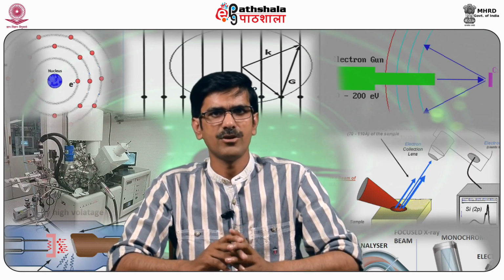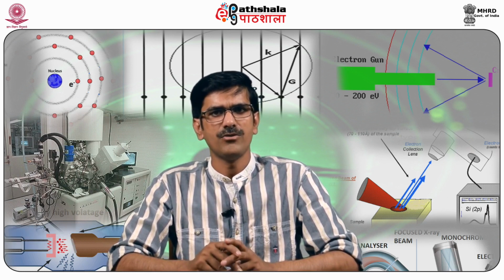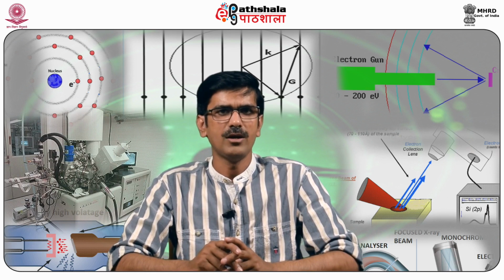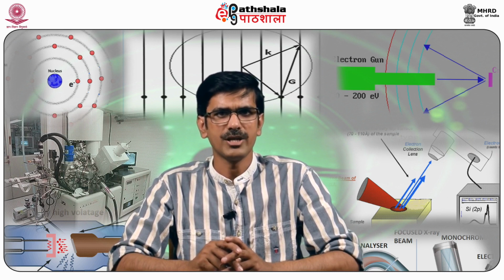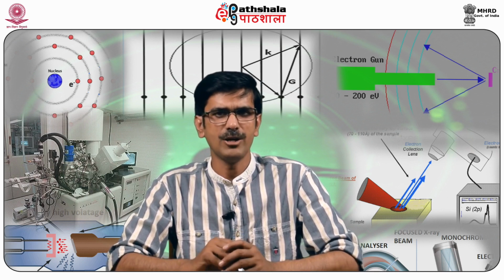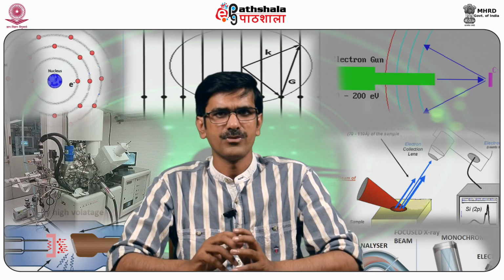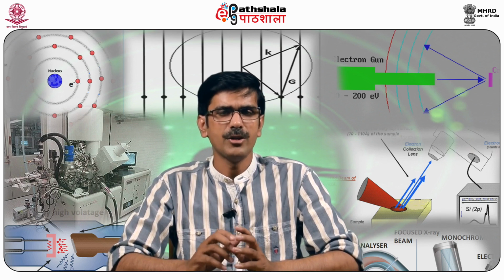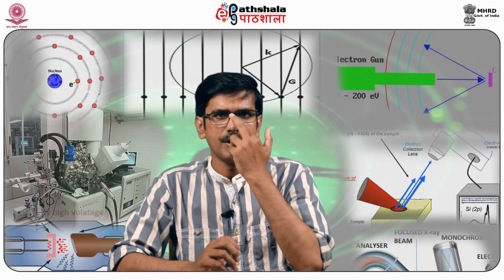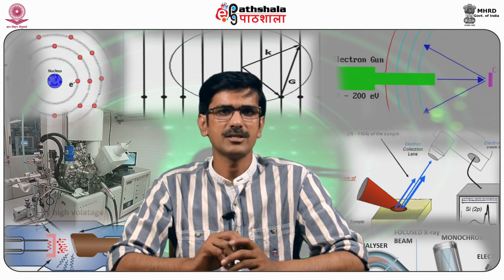Now, the next example is of biotite. Biotite is a silicate material of the mica group having the formula potassium, magnesium, iron, whole thrice, aluminum, Si3O10, OH whole twice. It is a sheet silicate in which iron, magnesium, aluminum, silicon, oxygen and hydrogen form sheets that are weakly bonded together with potassium ions. In biotite, strong peaks of magnesium, aluminum, silicon, potassium and iron are seen.